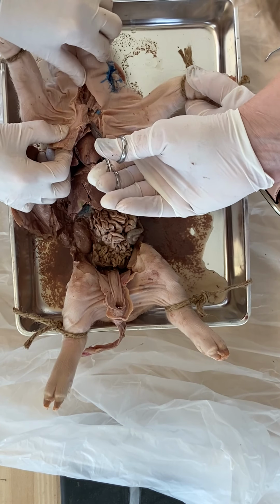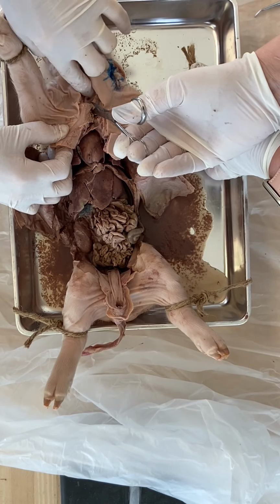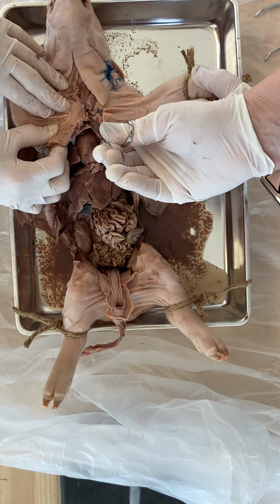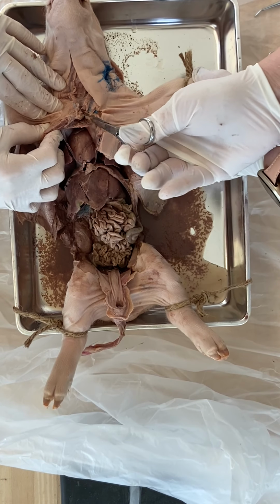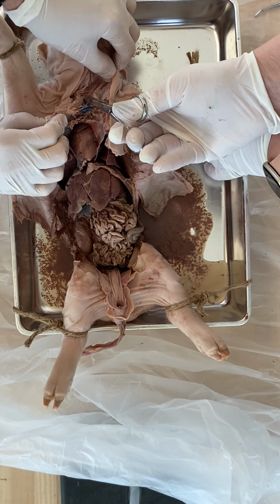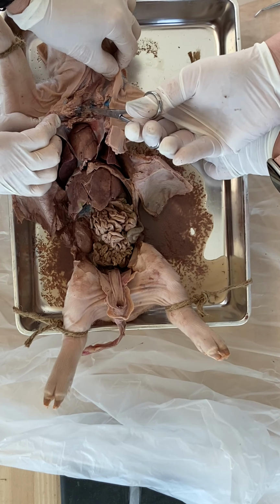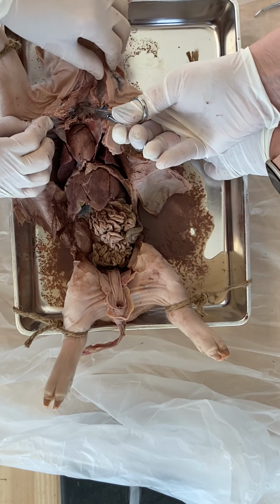Oh, yeah. So we want to be steady here because we're trying to find... See, I sliced the larynx a little bit. I went too deep. You killed this pig, Mrs. Martin. I went too deep. Oh, my goodness. We want to be able to show you the trachea and the esophagus quite nicely, so I'm going to take it steady here. Cutting through some blood vessels here, but it's like gardening.